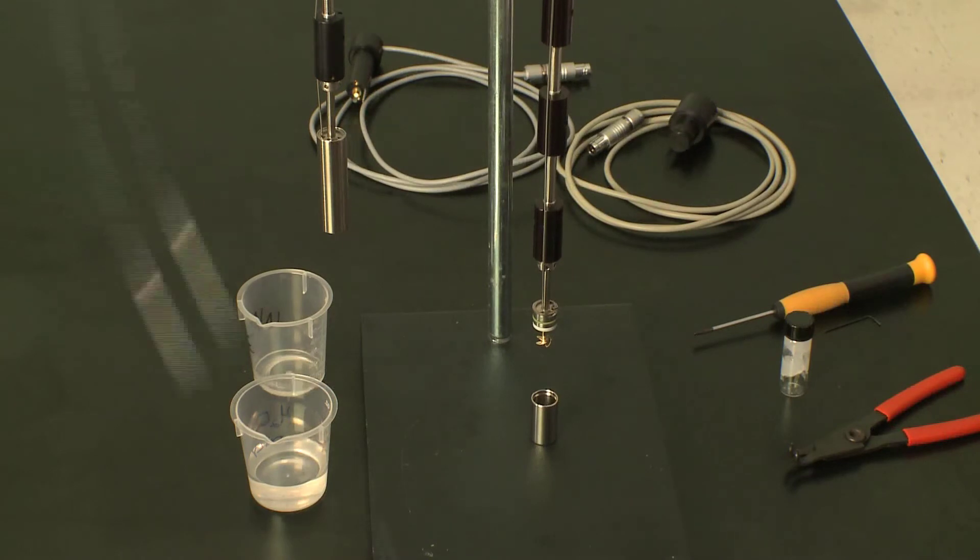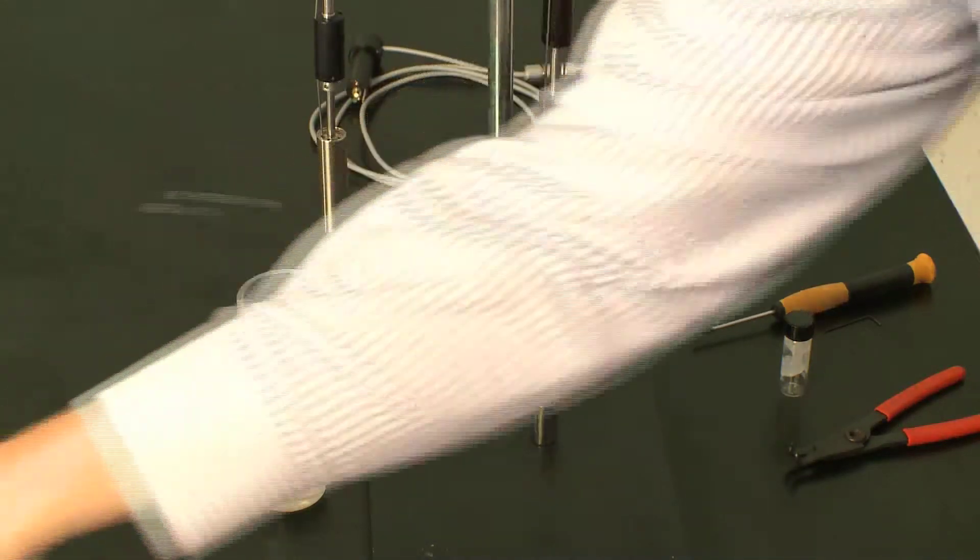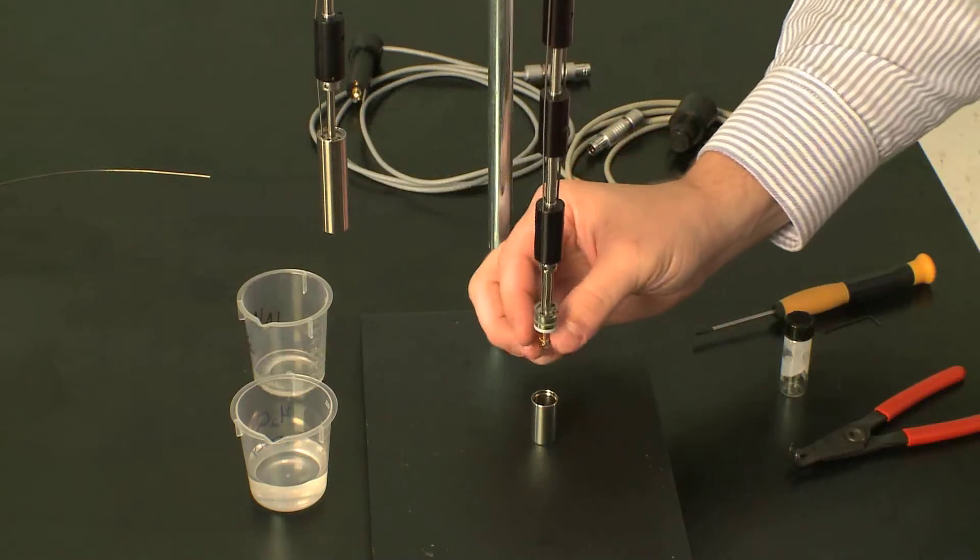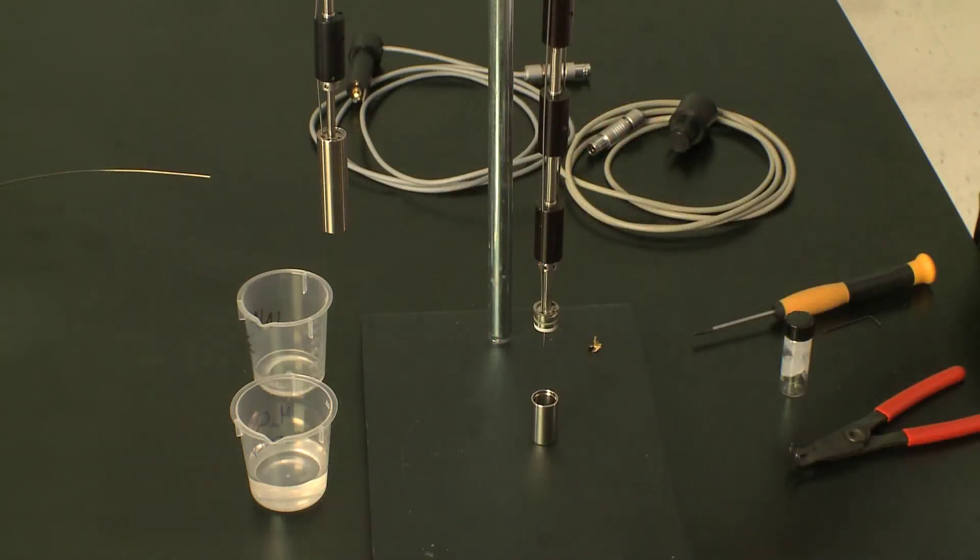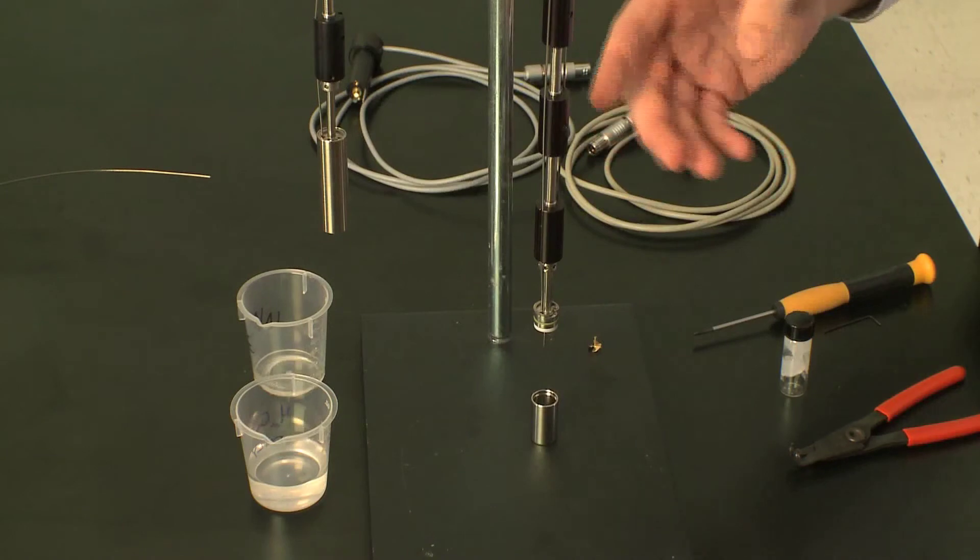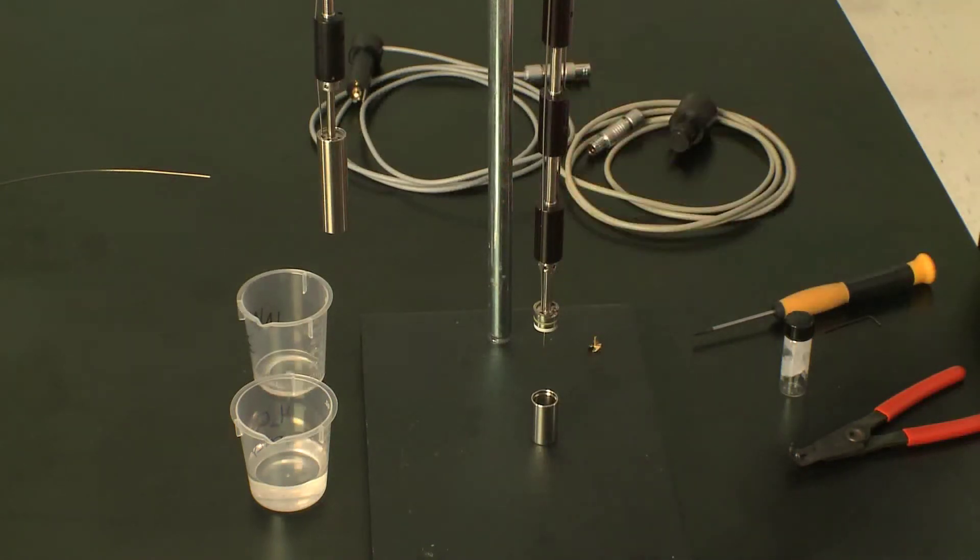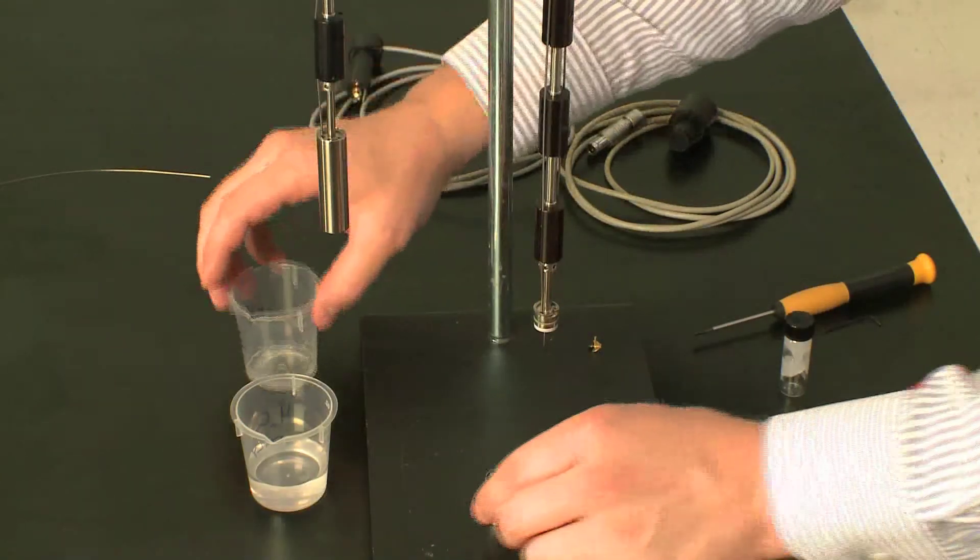Now we have the stirrer height and cannula height adjusted. We have to wet the central shaft of the ITC ampule. Wetting the shaft is important because you have a large dead space above your sample, and you don't want any evaporation to occur during your experiment.